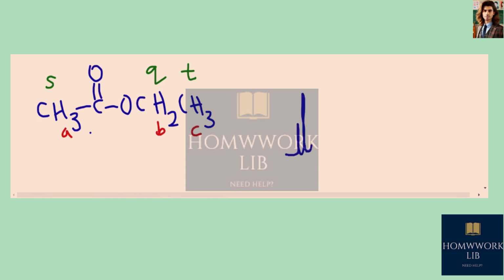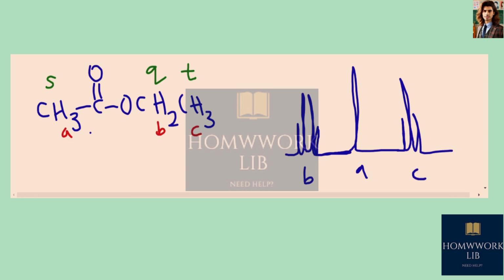So the 2 protons from B that are adjacent to the oxygen will give rise to the quartet, and they'll be the most downfield. And then it will be the singlet corresponding to the A protons. And then finally it will be the triplet corresponding to C protons.